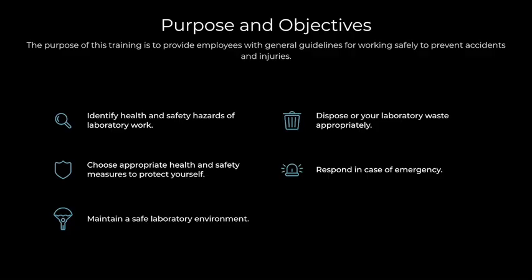Maintaining a safe laboratory environment. It is also important to keep the laboratory clean and organized to reduce the risk of accidents. This includes properly storing chemicals and materials, keeping walkways clear, and properly disposing of waste.